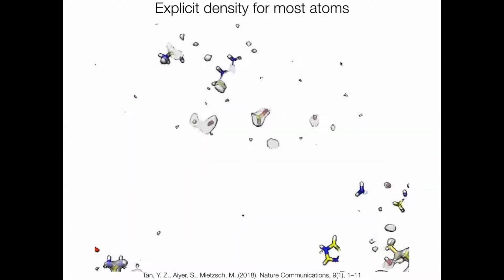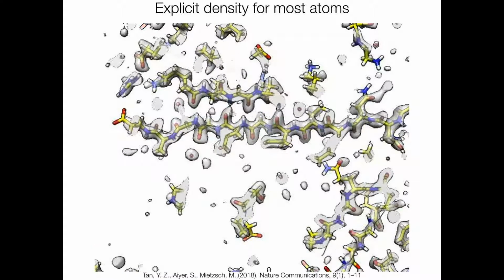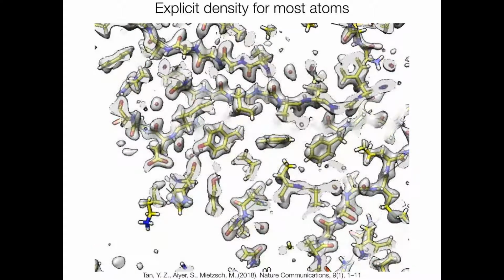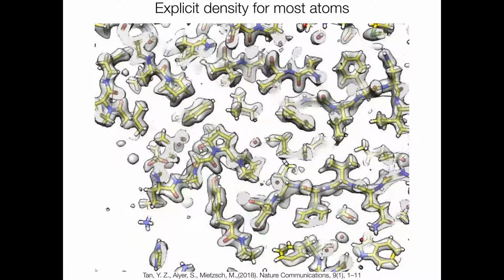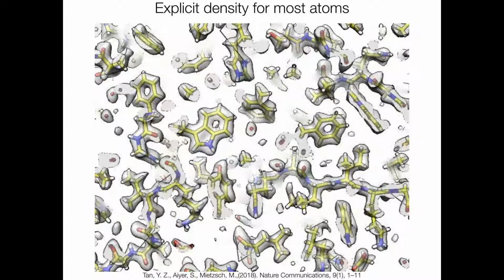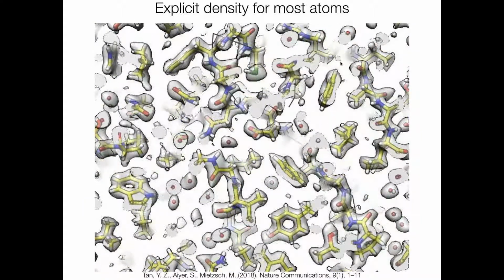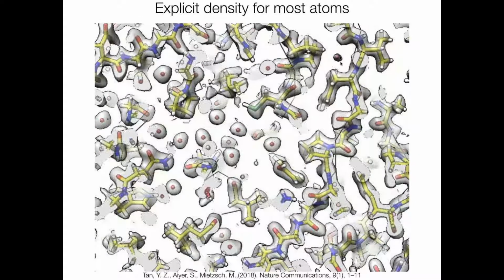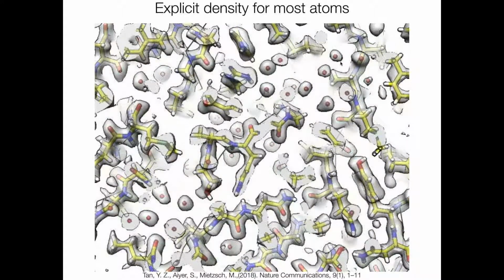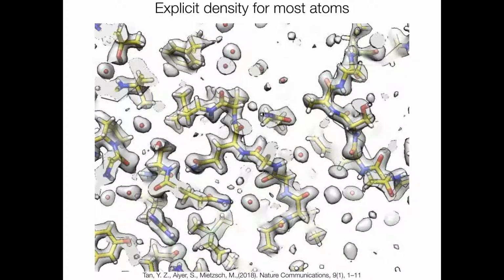And this is just, if you look at one particle to the next, you see the different rotamers. Yeah, you could definitely see different rotamers. Yeah, absolutely. In fact, you can see multiple rotamers. We are averaging together all of these.